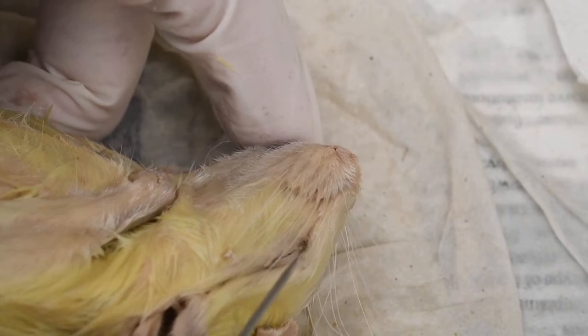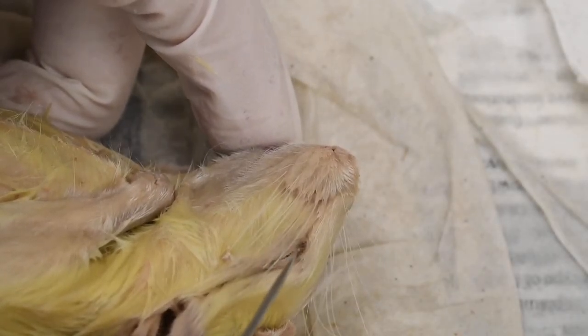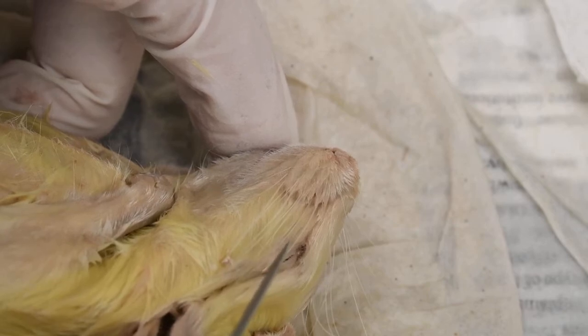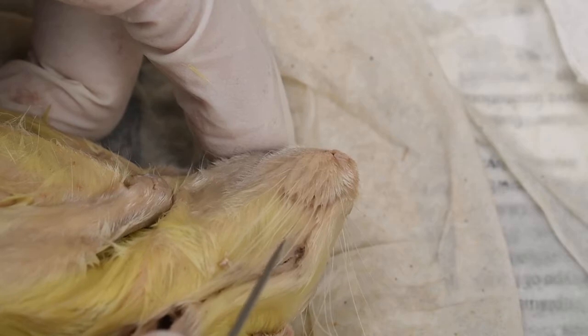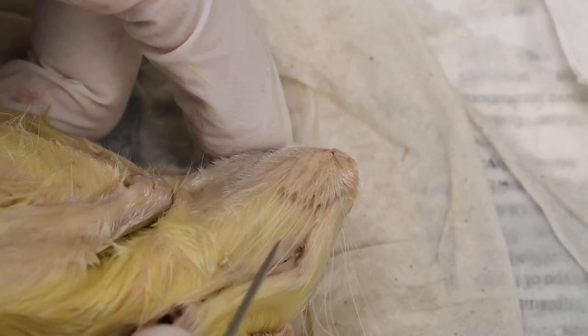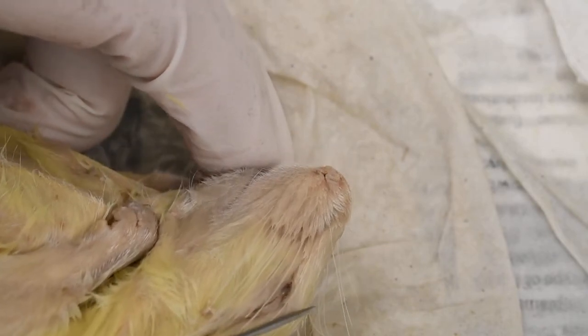Now, just like in the frog, the eye has a nictitating membrane. It's pretty difficult to see without looking at it with a stereo microscope. But in us, it's that little triangle at the corner of your eye next to your nose. So that's what the nictitating membrane is.